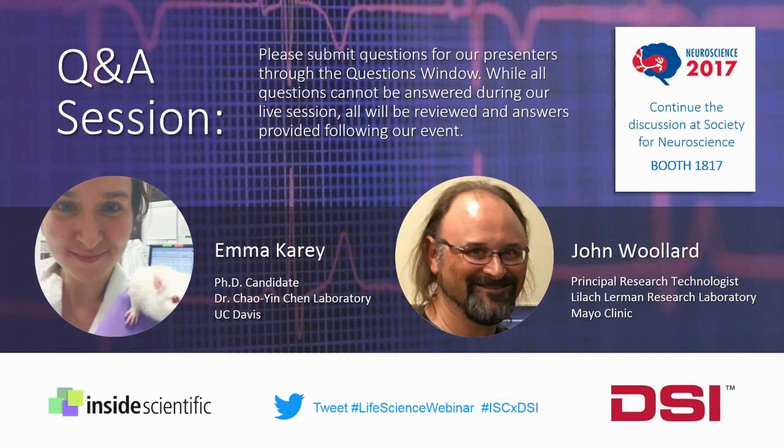it's a question of: do you want to eliminate all of the bad data and a little bit of the good, or do you want to keep a little bit of the bad data and not eliminate any good? That's the line you have to figure out. We decided that 20 may be, you know, it may be 21 is perfect. It might be 18 is perfect. There's no way that we can truly know that. But we found enough consistency across a couple of animals, both in mice and rats, where we felt confident that we were eliminating enough bad data that we were getting to a true, real physiological value. Okay. Very good.